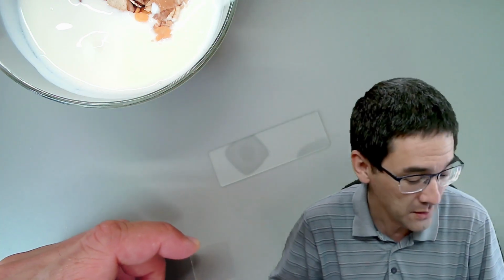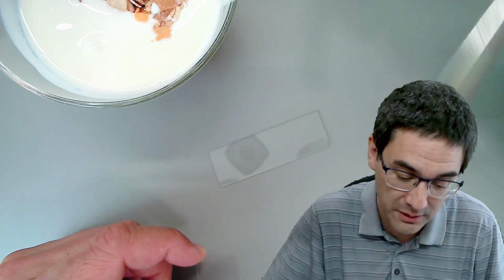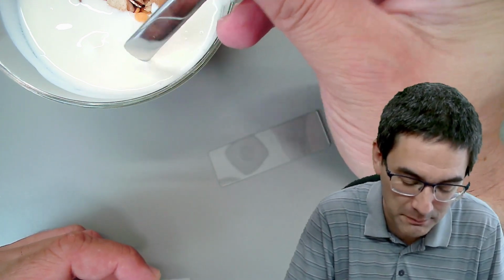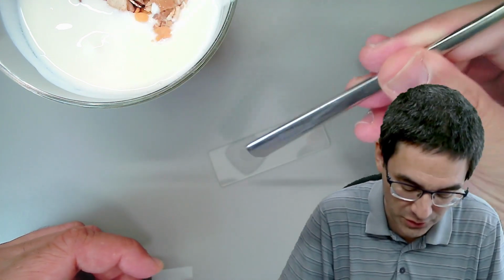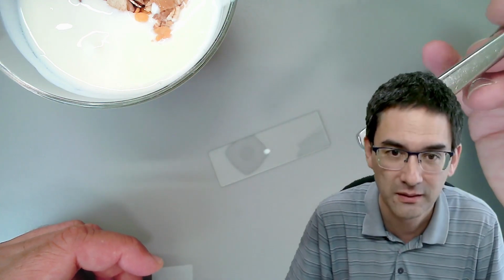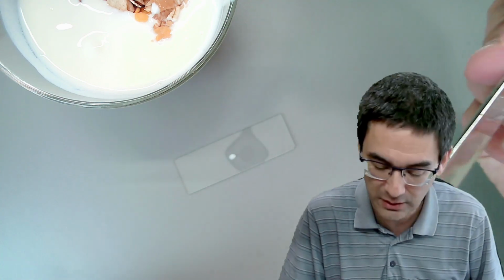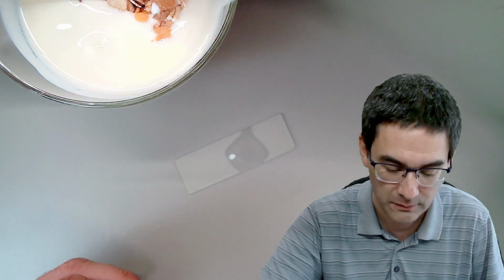Otherwise the bacteria are going to move all over the slide and they're difficult to focus. So what I'm going to do now is take the back of my spoon and dip it carefully into the yogurt. You see? The small amount here should be enough. Okay, I'm going to carefully put the spoon again over here on the top.